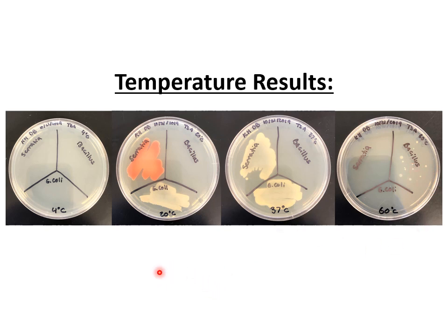So make sure that you're comfortable being able to visualize what's growth, what's not growth, and what that growth looks like. Is it robust? Is it minimal growth? Is it beige? Is it red? Okay, so always be very specific about your analyses.